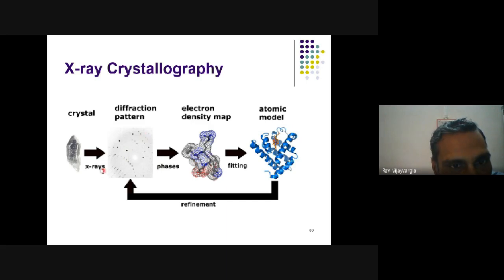So eventually, wherever the X-ray is put on the detector, it will produce dark and light, just like when you expose an X-ray film. All of you must have seen the X-ray film that we see for bone or structure. Wherever the X-ray could pass, those areas will become dark, and where the X-ray does not pass, it remains light. So here also it's a molecular X-ray only.